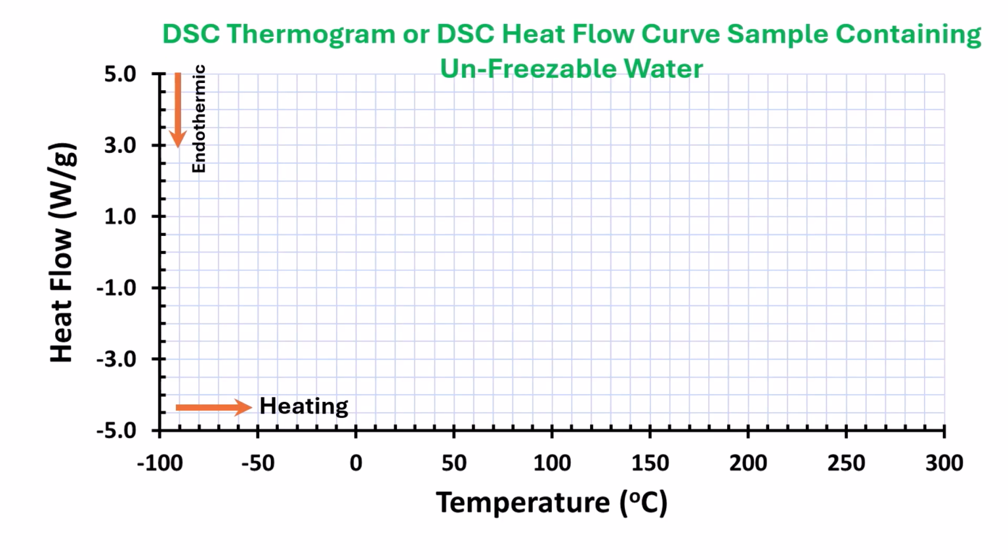We could just run a DSC scan from room temperature to -90°C and then heating from -90°C to 300°C at a heating rate of 10°C per minute. This can give us an initial idea of the sample. First, we could run the dried slice.